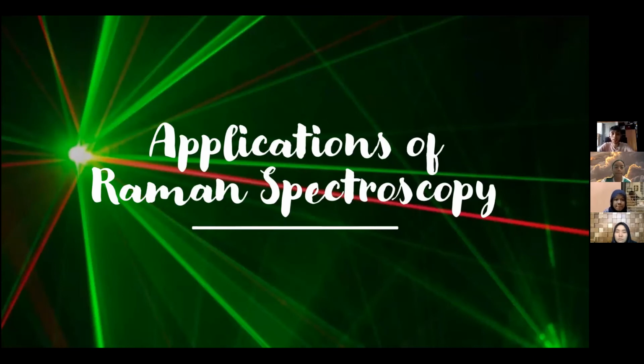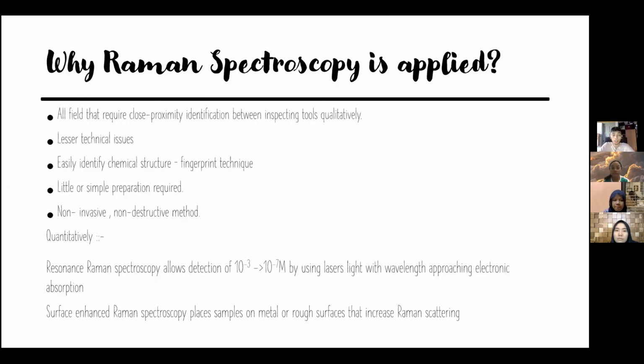Next, the applications of Raman spectroscopy. There are many uses for narcotic, pharmaceutical, and medical, and chemically it can be used to detect anything. So why is Raman spectroscopy applied?